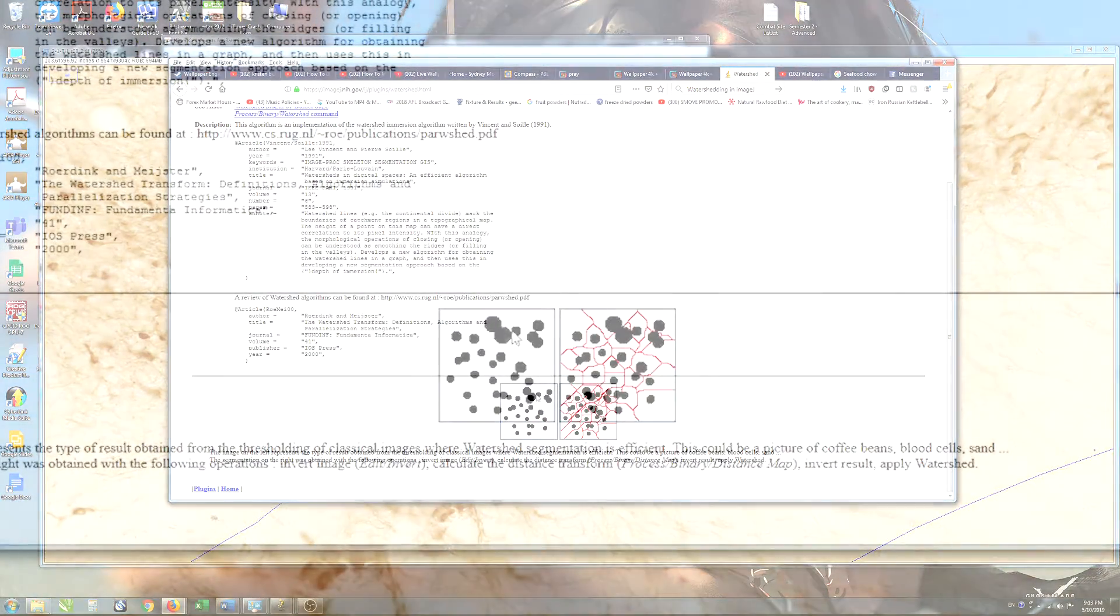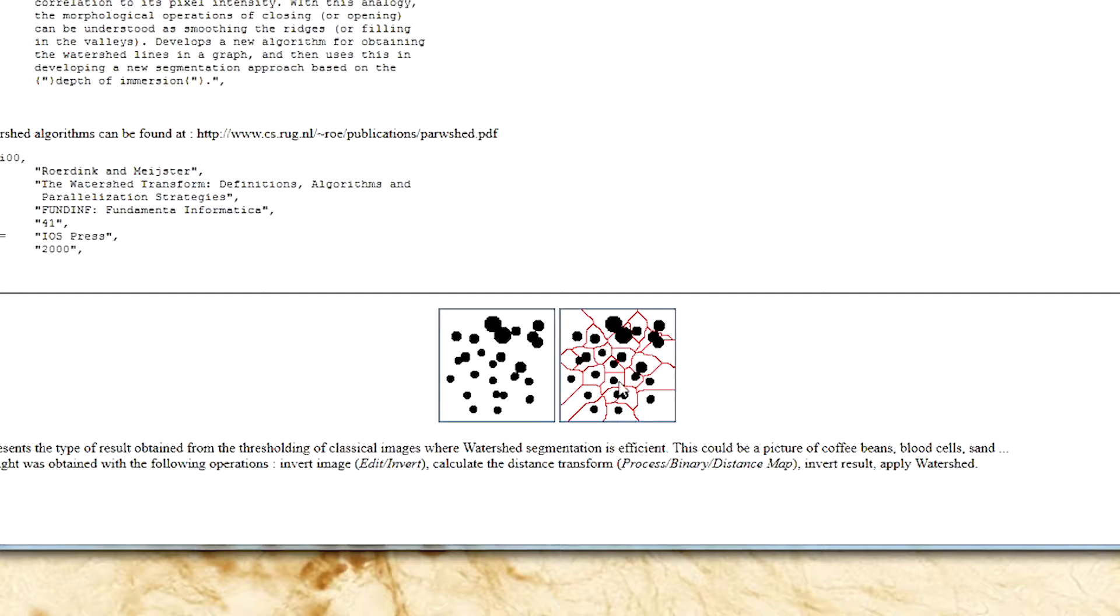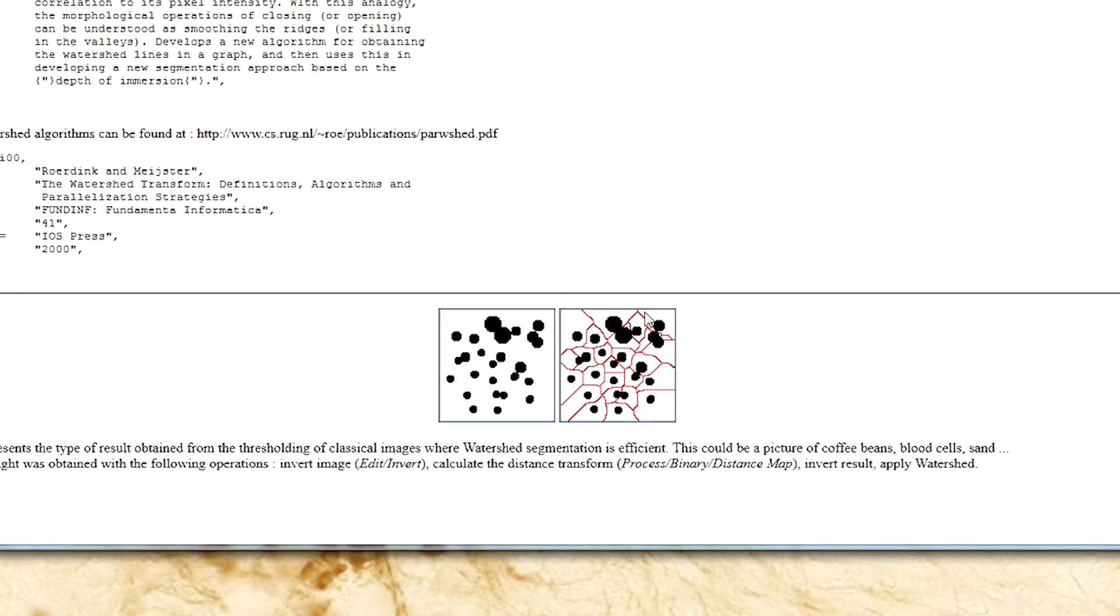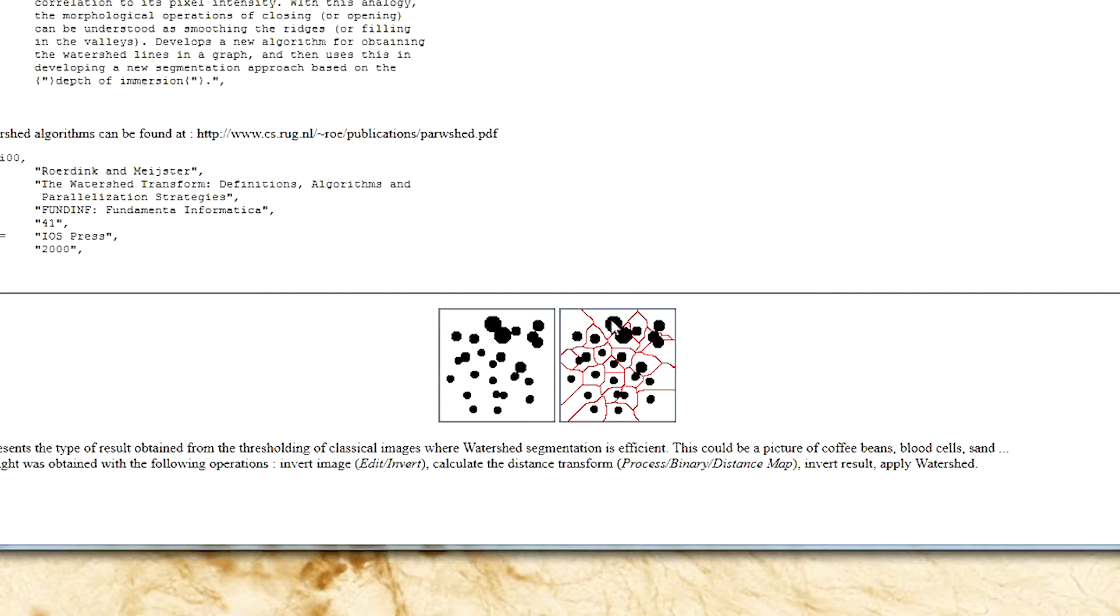You get a picture like this. So they use circles or spots, just as an example. And some of those spots are touching each other. And so this image here demonstrates what watershedding is doing to our cells as well. Our cells have also turned the image into a binary black and white image where neighboring cells are just sitting on top of one another. However, the algorithm looks for the narrowest point between those irregularly shaped splodges and calls them individual cells and just draws a line around them.